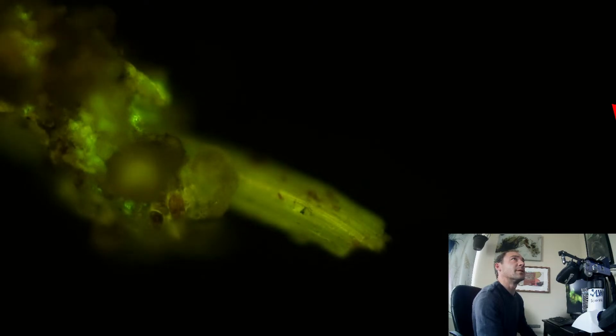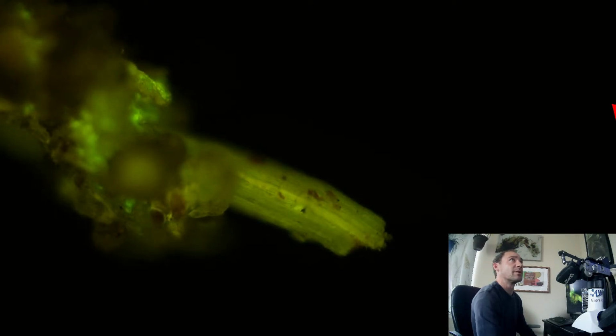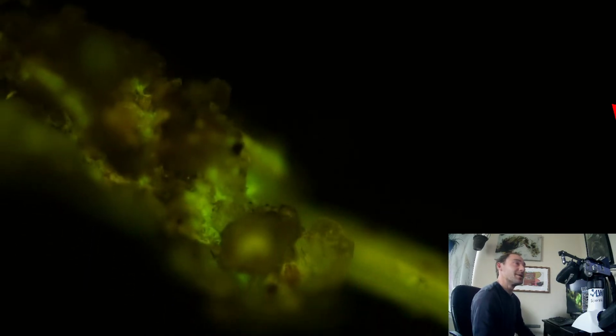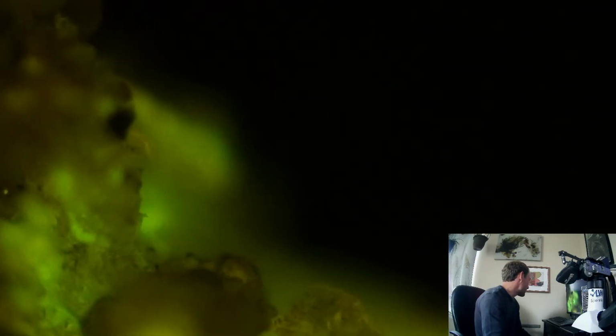Yeah, glowing a whole bunch right at the end where the tweezers pinched it. I find that a lot, where wherever I pinch the root or where the root breaks, there's a whole lot of glow. I think we kind of squeeze some phosphorus out of there, so to speak. Pretty cool looking. Go into 4x real quick, see if we can get a good shot.